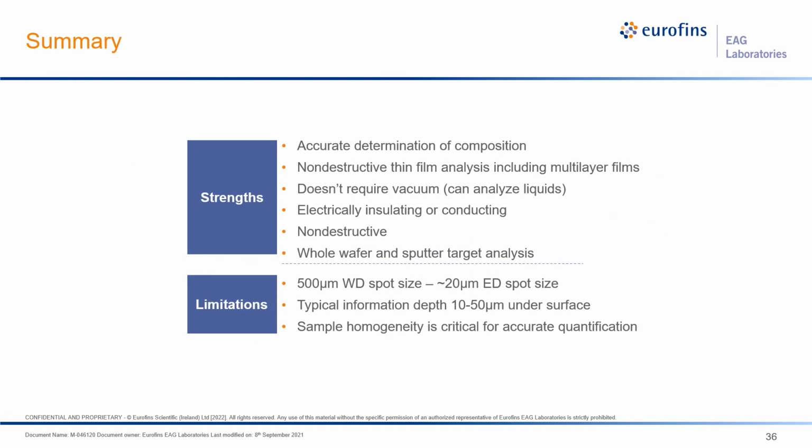And that brings us to the end, so let me summarize the high points. XRF is a technique that can accurately measure compositions of practically any solid. Standards are generally not required, but the accuracy will always be better with matrix-matched standards for calibration. The technique can be used for non-destructive characterization of thin films, including both thickness and composition.